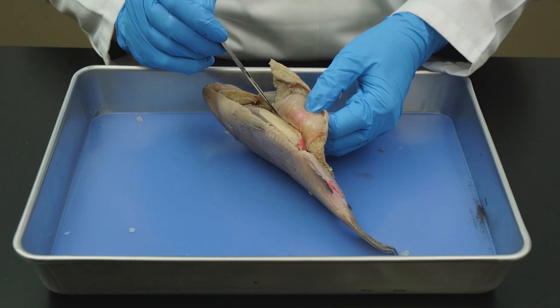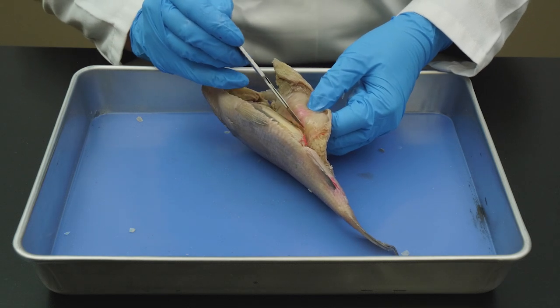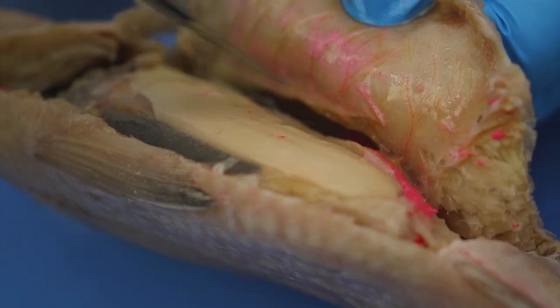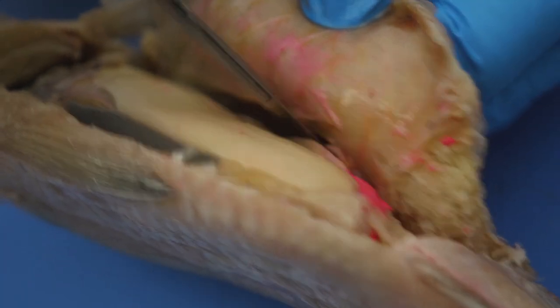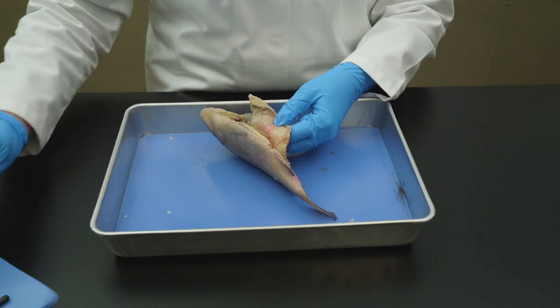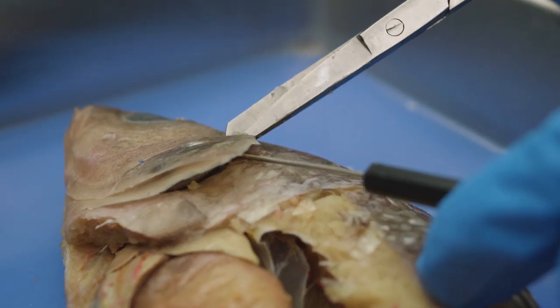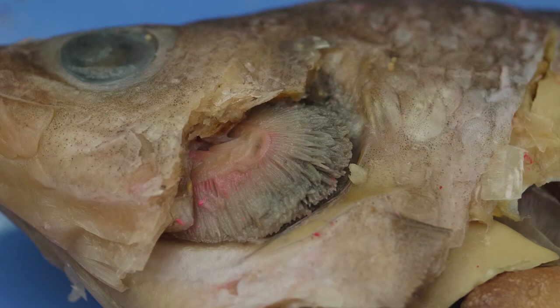Now that we have made our incisions, we lift up the skin, muscles, and bones that surround the body cavity. Notice that there is connective tissue still holding the skin, muscles, and bones to the underlying organs. We need to cut this connective tissue with our scalpel to release it. One final incision is needed to remove the operculum. With the operculum removed, we can examine the respiratory system.